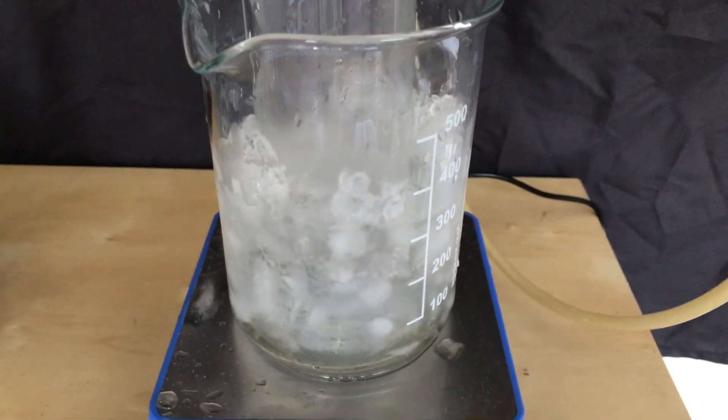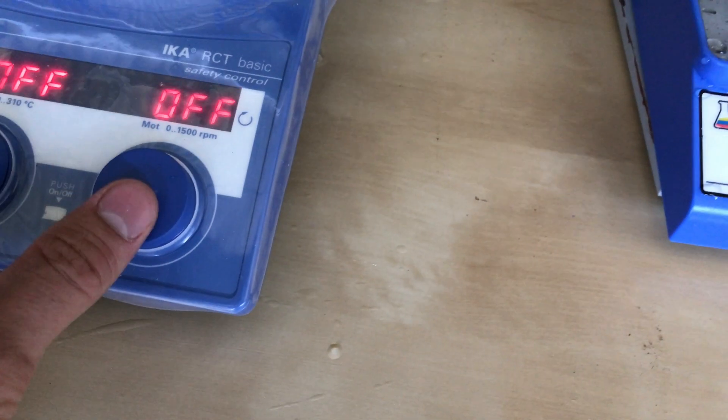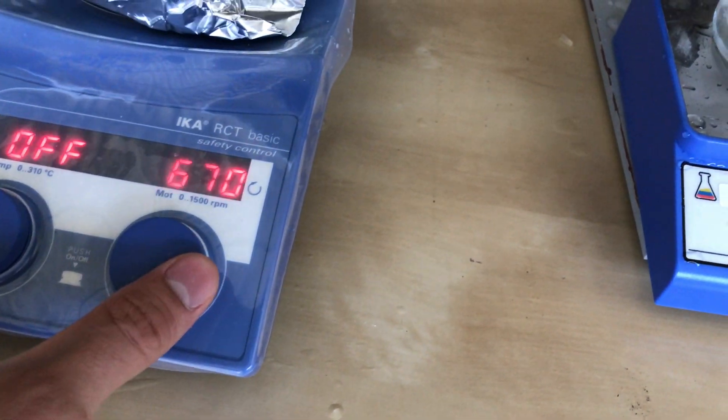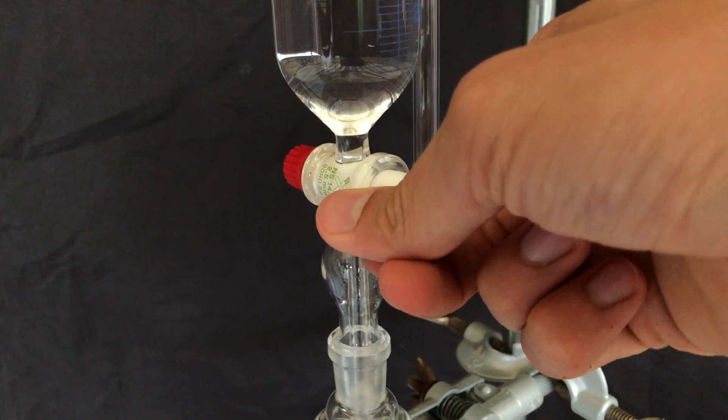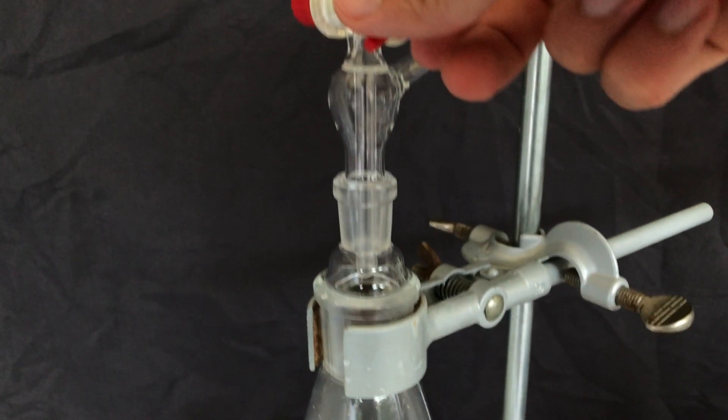The DMF was added to the pressure equalizing addition funnel and we set up an ice bath for the gas washing bottle. To start off we only had to do one thing: magnetic stirring was turned on and we opened the stopcock.